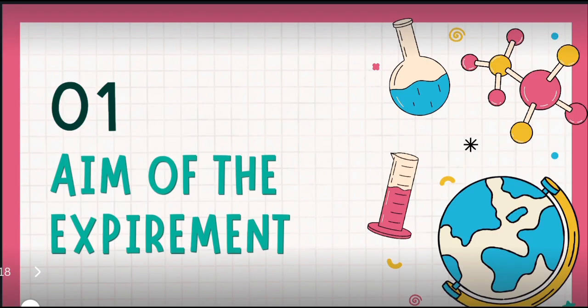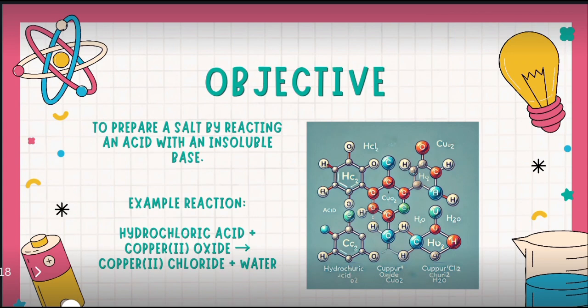Aim of the experiment. Objective: to prepare a salt by reacting an acid with an insoluble base. Example reaction: hydrochloric acid plus copper oxide equals copper chloride plus water.